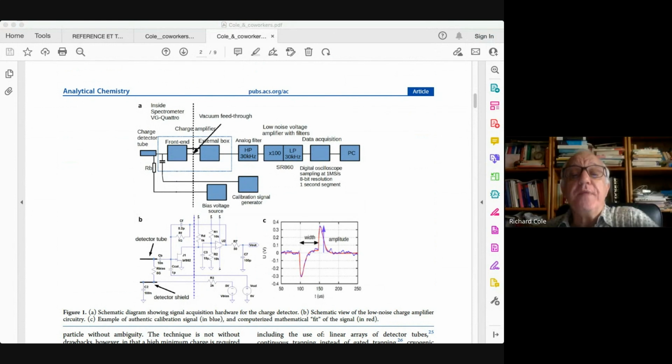Okay, well, this is a really short time scale. This is a microsecond time scale. We're capable of seeing something like 200 events per second. Now, if it turned out that multiple particles entered at the same time, then it would give a confusing type of signal, so the data system would reject that.